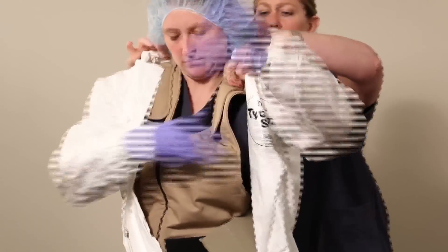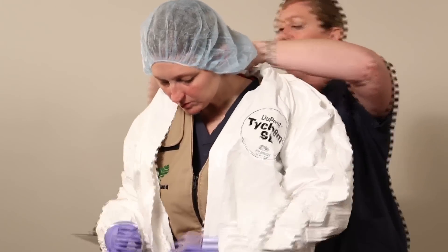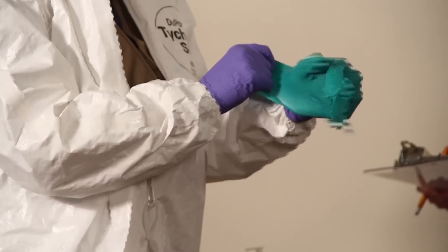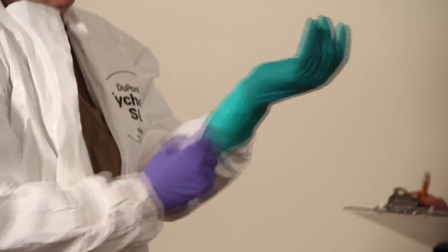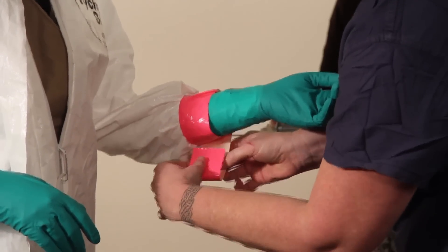Put the Tychem SL suit all the way on, but zip the suit only to your waist. Then tuck your hood into the suit — your donning buddy can assist you with this. Don your second pair of gloves and stretch the openings over your suit. These are the tight-fitting surgical green gloves. Tape the gloves to your suit with chem tape or duct tape, leaving a tab for easy removal.